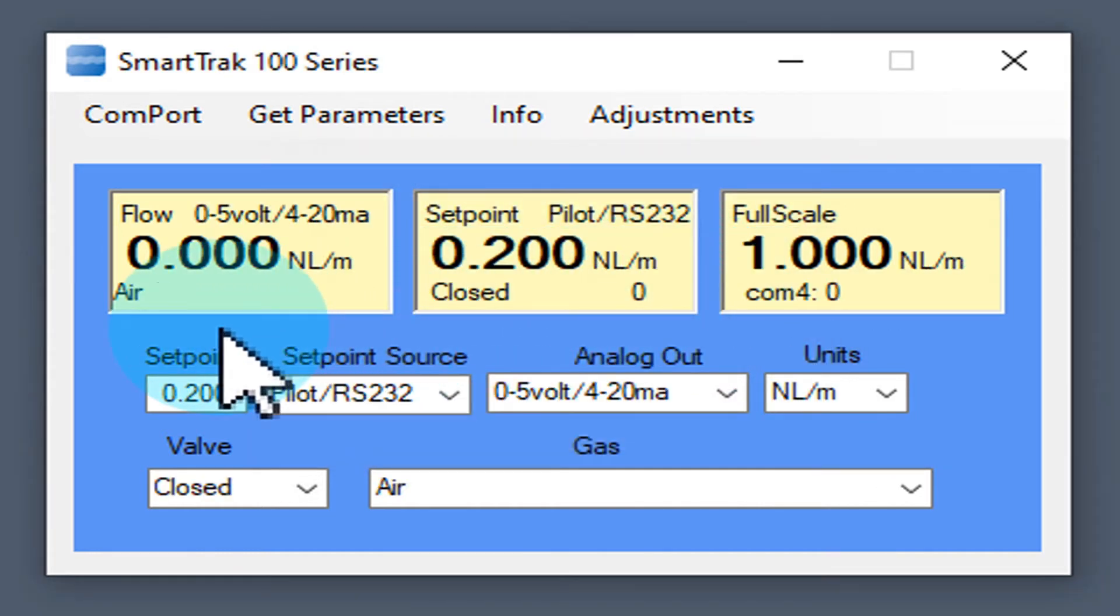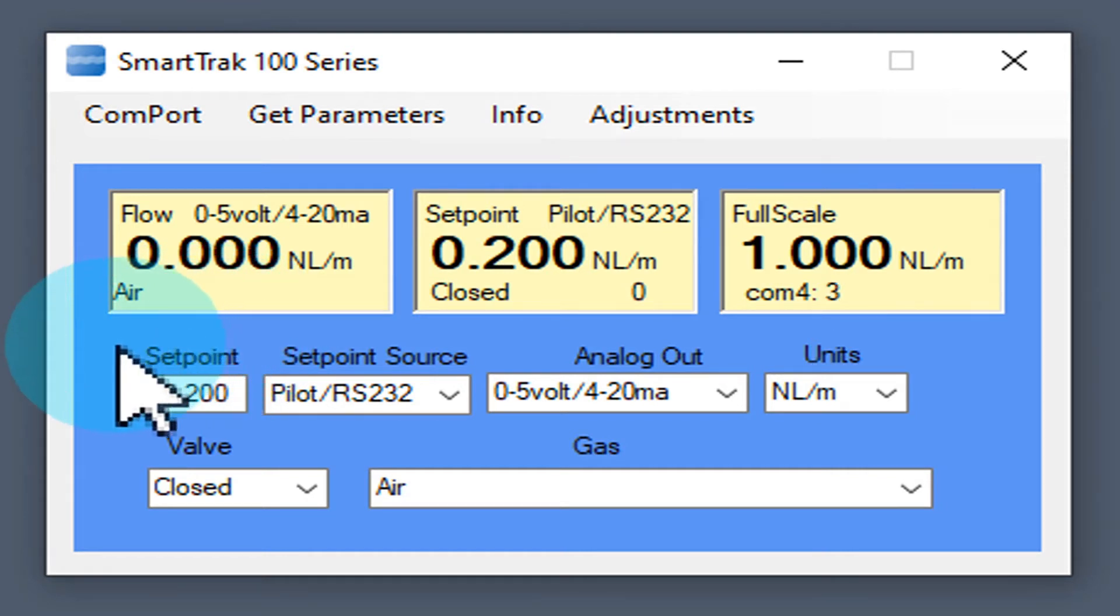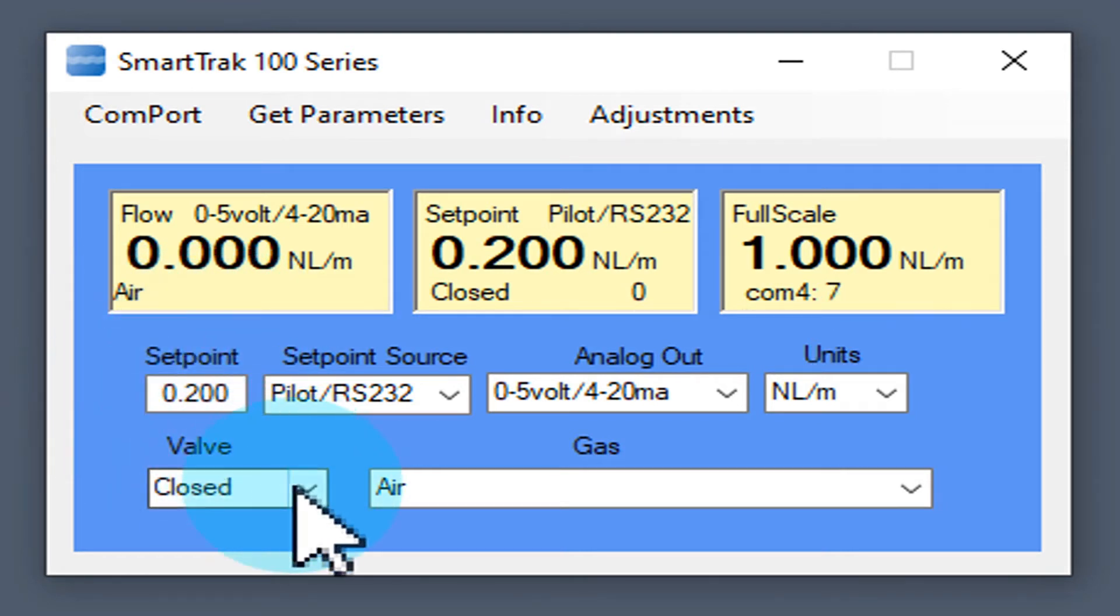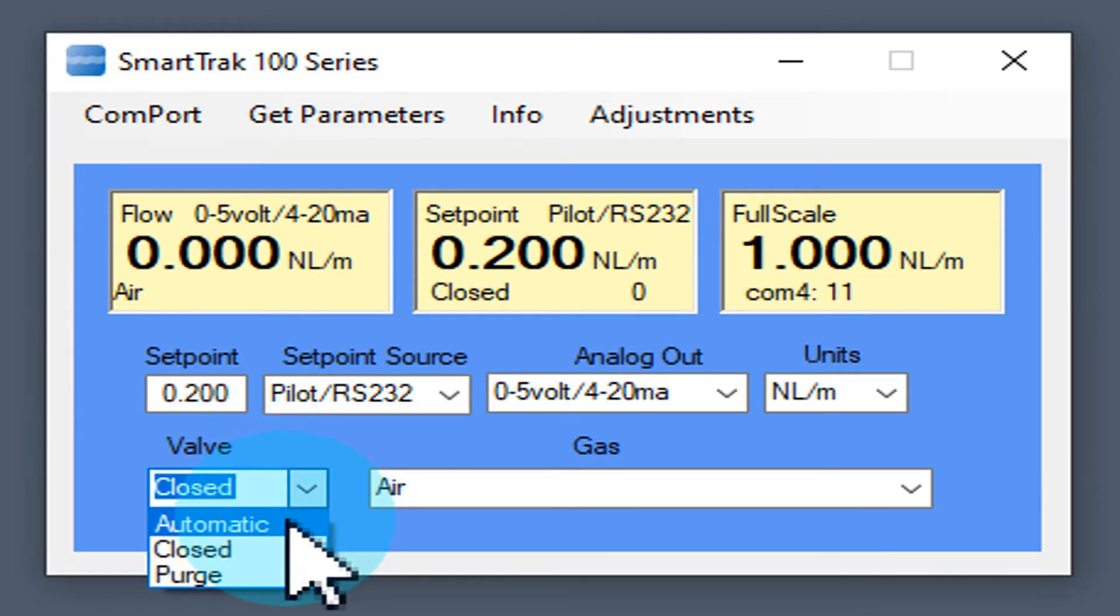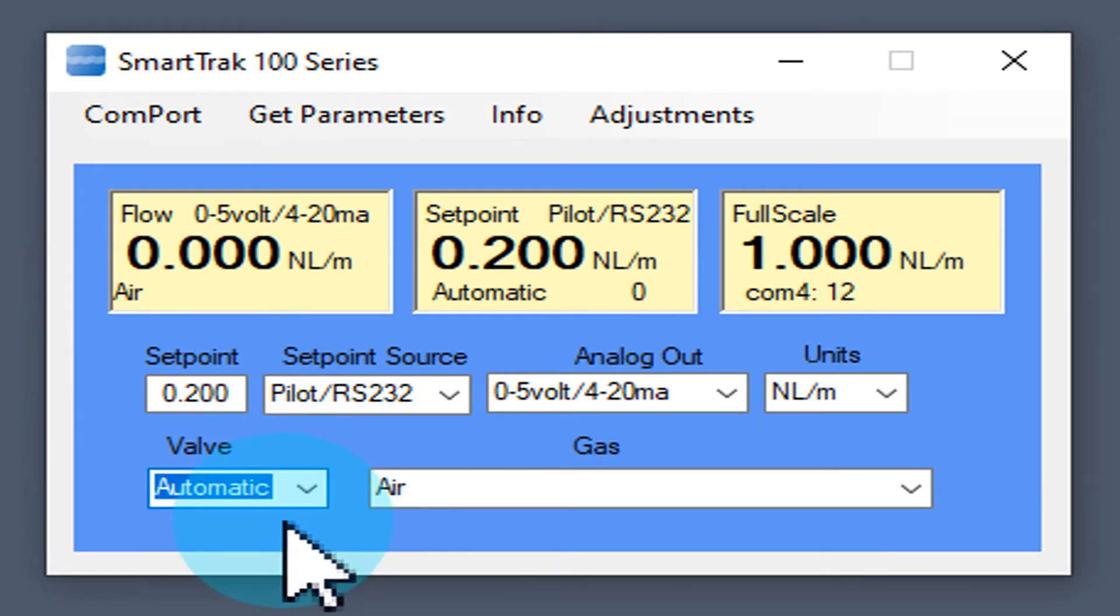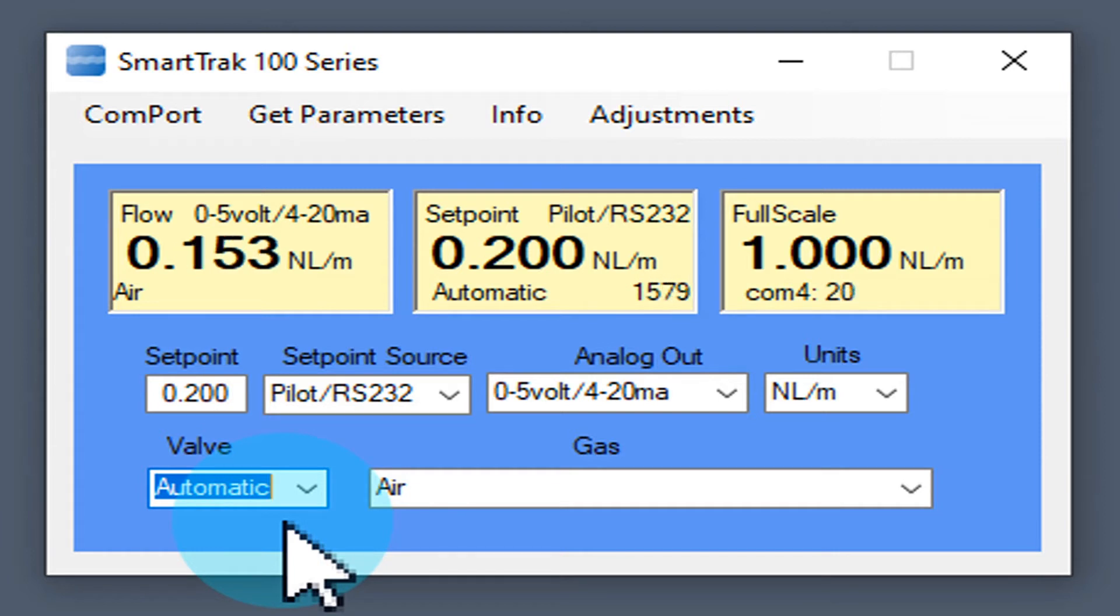As soon as you see the gas name in the flow window, you are connected to your device. Currently there is no flow because the valve is closed. Choose now automatic and your device starts to control flow to the value set in the setpoint field.